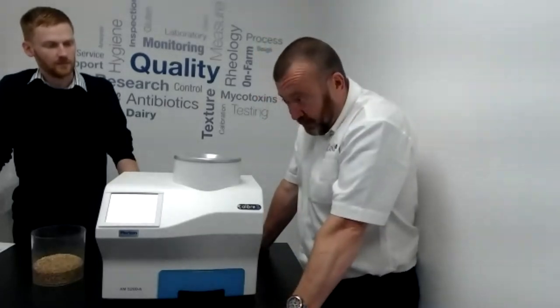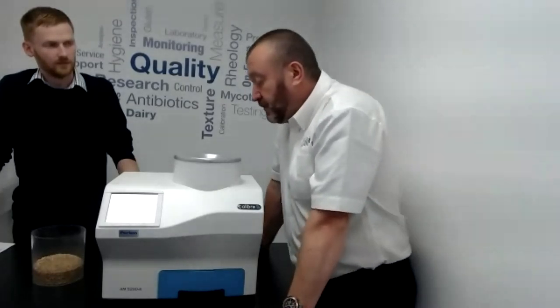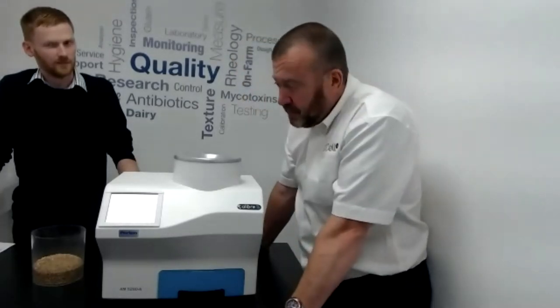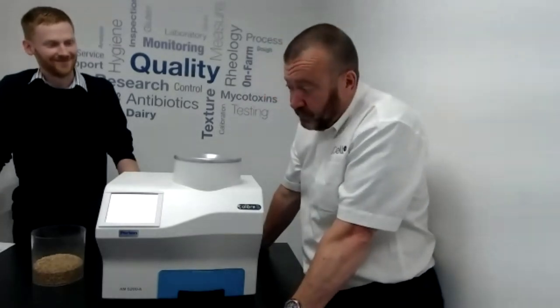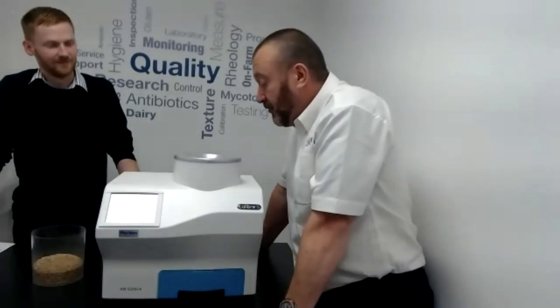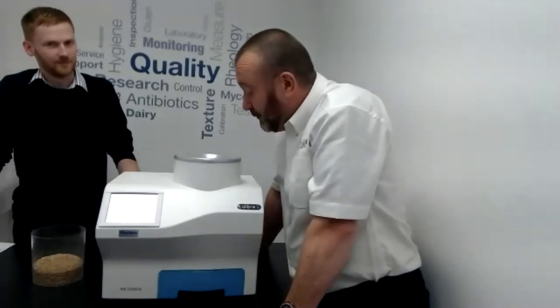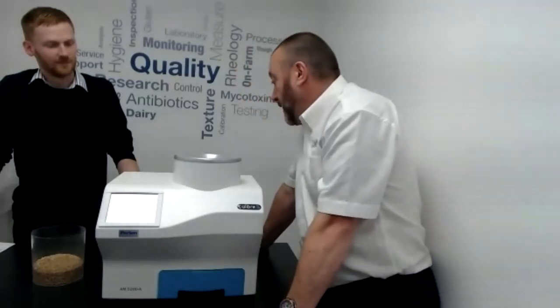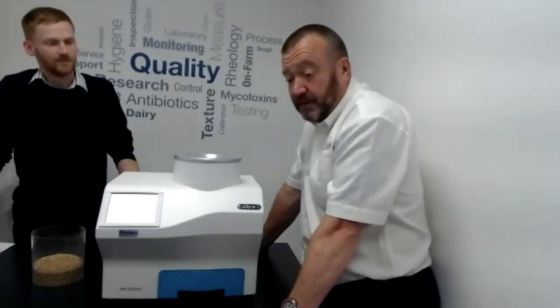For servicing, we recommend an annual service on these instruments. Although the sample cell is self-contained, we occasionally get grains filling inside it, so we strip all the covers off and sweep out any stray grains. We then recalibrate the specific weights and recalibrate the temperature sensor. We can also download any data, which just requires a USB stick.